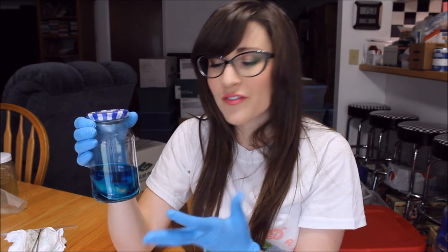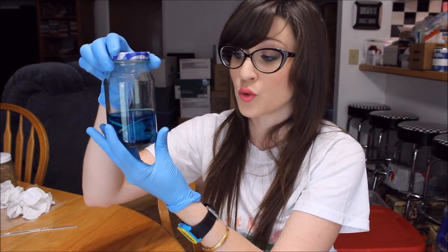We're gonna leave them there for about a day or so. Don't worry if your specimen looks like it's tinted a little blue, because we want that to happen. Most tissues of your specimen will initially take up this blue stain. The blue color that all of it picks up will be removed later on in steps as we go further into diaphonizing. You want to make sure you have your specimens fully submerged in the Alcian Blue solution.